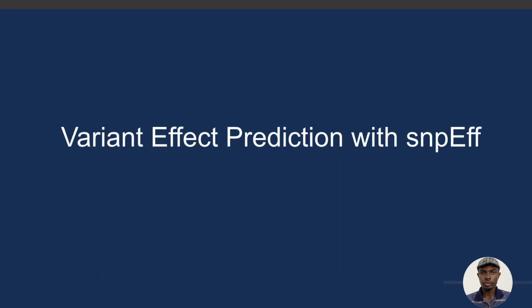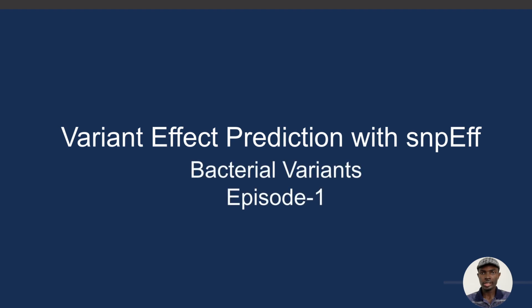Welcome to my tutorials on variant effect prediction with snpEff. For this tutorial, we are going to look at bacterial variants. This is one of many episodes I'm making on bacterial variants, so you should always come back to this channel to watch more of such tutorials.